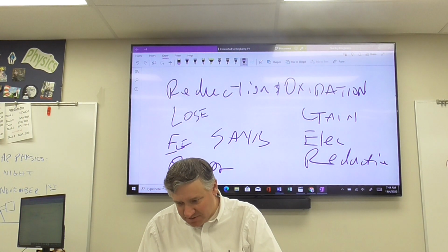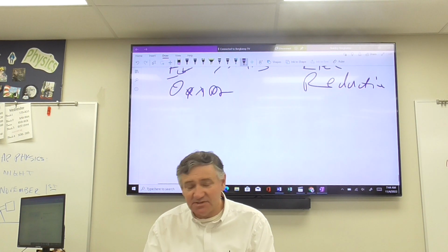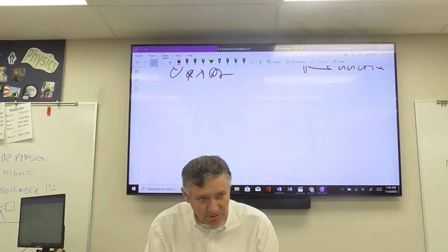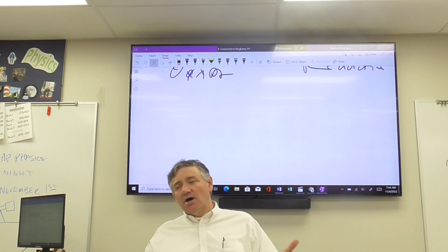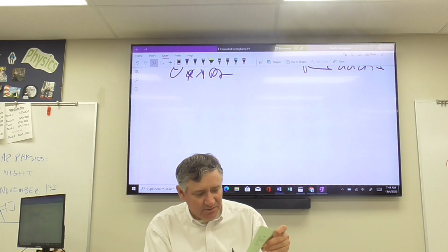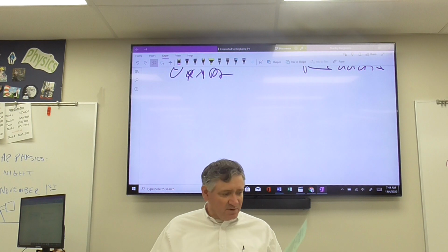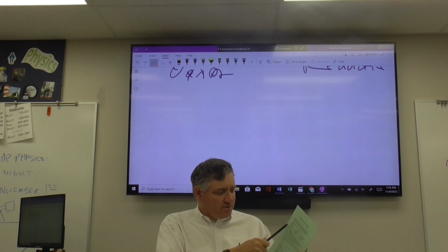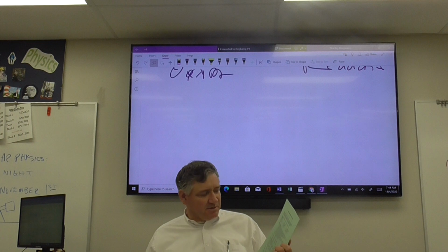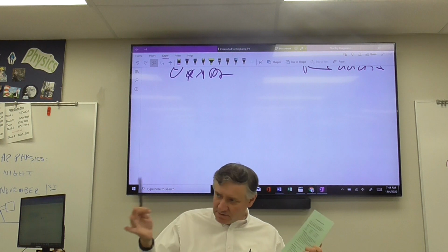Now, the other thing that's going to happen as you go through this is that you are going to have different concentrations. You've got to pay attention to masses, things like that. Some of these volumes and masses that you measure out are kind of close. Other ones have to be very exact. For example, the first thing you're going to do for this pre-lab is have all of your glassware labeled. The purpose of this is that you're going to look at the different oxidation states of manganese all the way from 7+ to 2+. So you want to make sure that you have your glassware out and labeled to begin with.